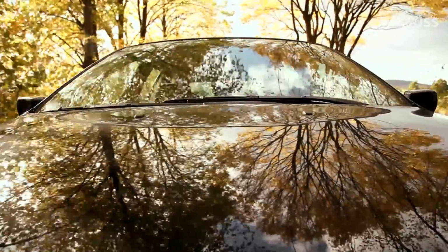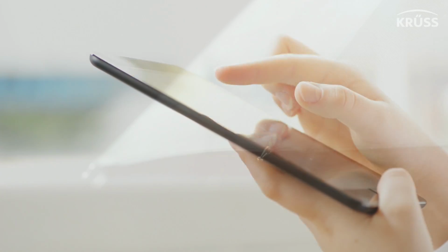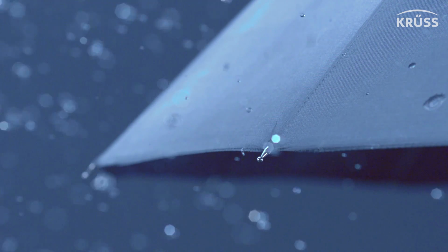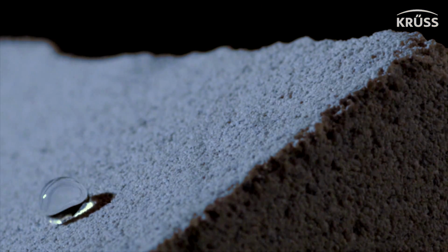In almost every situation in our life, we experience surfaces. However, one of the main characteristics of a surface remains invisible: the surface-free energy. But it substantially influences the behavior of a liquid. Surfaces can be hydrophobic and water repellent, or hydrophilic and hence easily wettable.